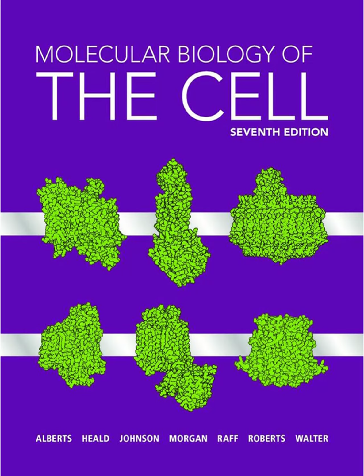Wow. That's an incredible toolkit just within light microscopy. Right. But sometimes you just need higher resolution, right? Down to the molecular level. That's when you have to leave light behind and turn to electrons. Electron microscopy, or EM. Using electrons instead of photons. Right. Electrons have much, much shorter wavelengths than visible light, which allows for vastly superior resolution.